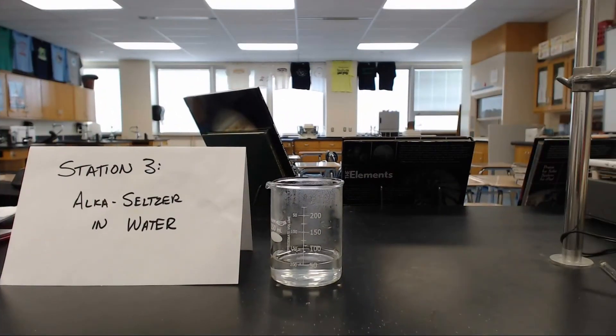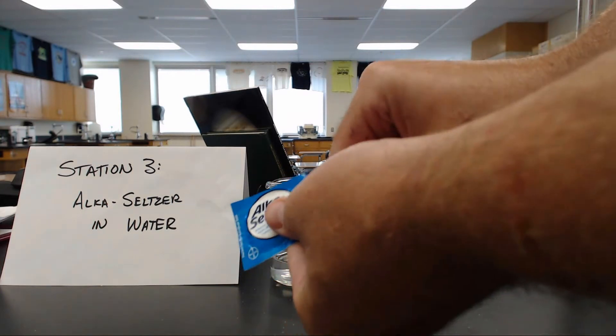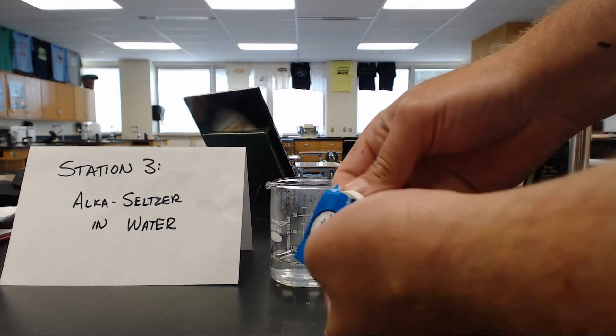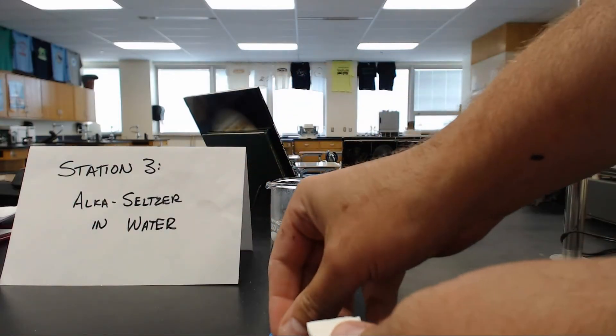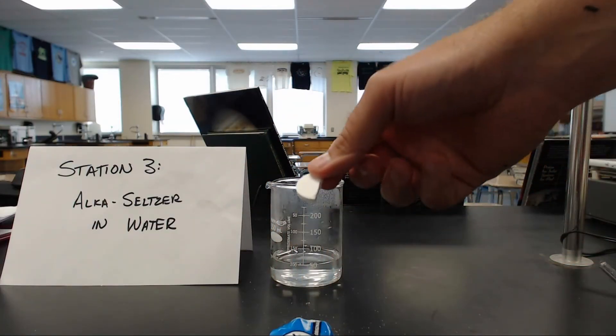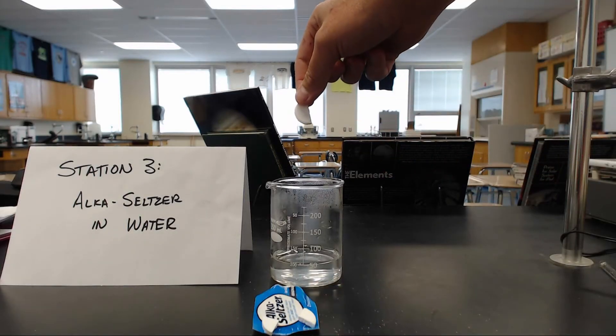I have a beaker full of water. I have Alka-Seltzer here. I'm going to open the Alka-Seltzer, take out one tablet, cut this tablet, break this tablet into pieces. I'm going to take this half and put it right into the water.